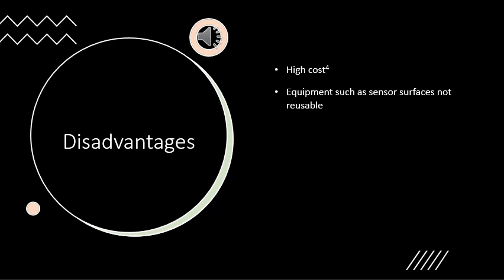Another disadvantage is that the machine needs very strict surface functionalization and experimental controls. This is because any small impurity or bad optimization of the sensor surface for your specific purpose, along with some shoddy temperature control or concentration control, can cause the analyte to interact with the metal film, the prism, or even other things in solution to give false positives.